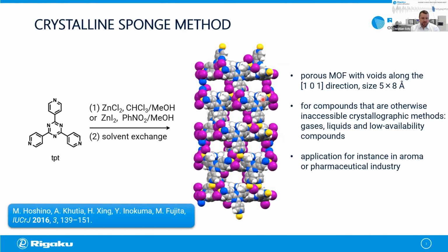The synthetic procedure is also described in this IUCR journal publication 2016 from Makoto Fujita. There is plenty of good synthetic protocols out there that you can use. The MOF itself, as I said, it's a porous material. Along the 101 direction, you have pores that are the size of 5 by 8 angstroms. You could include in here analyte molecules that are difficult to crystallize because they are of low availability. They could be gaseous, they could be liquids at room temperature.